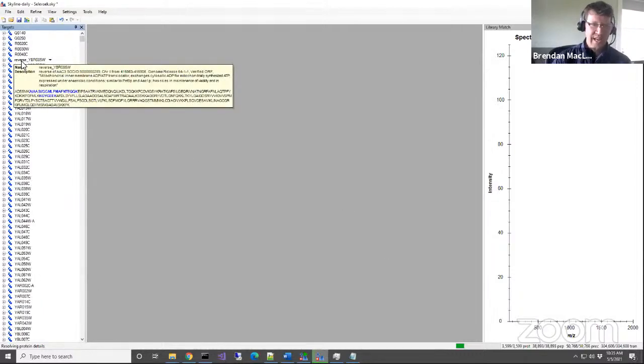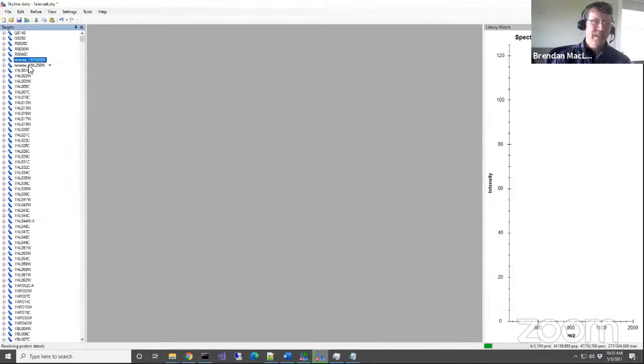And we're going to go ahead and delete them both. So you just click and control click to select them both, and then press the delete key on your computer and they're gone. So we're not going to take them forward any further, but it's nice to have that as a sort of feel good. Oh, okay, my false discovery rate at this point is pretty low.